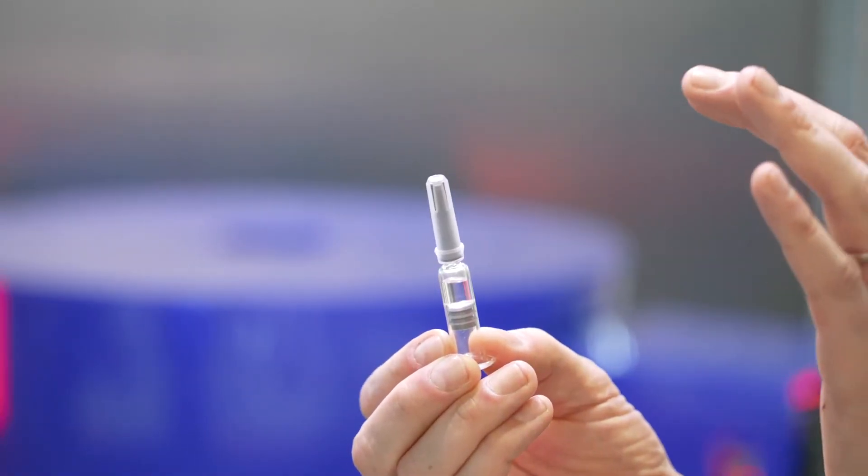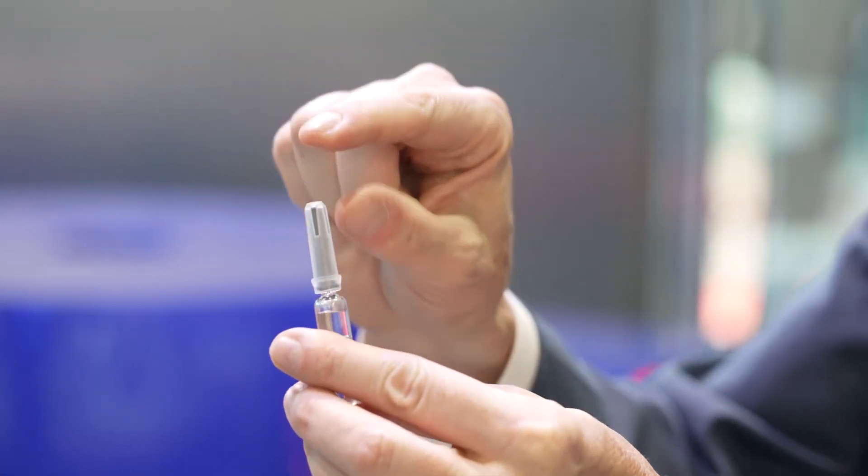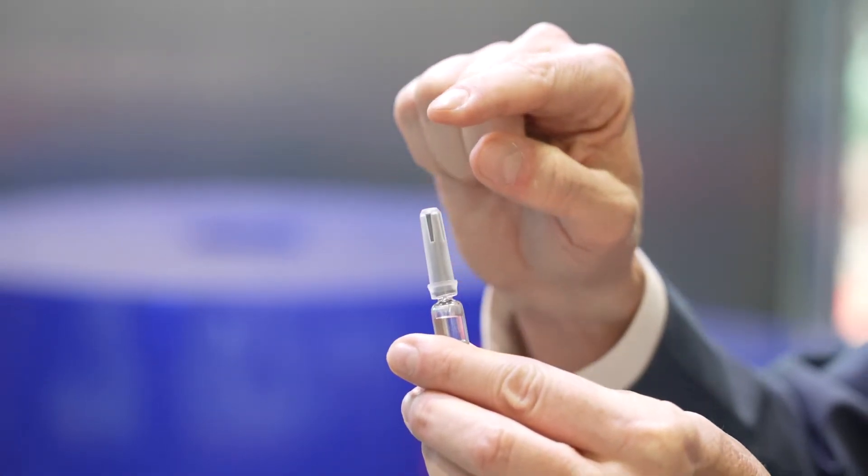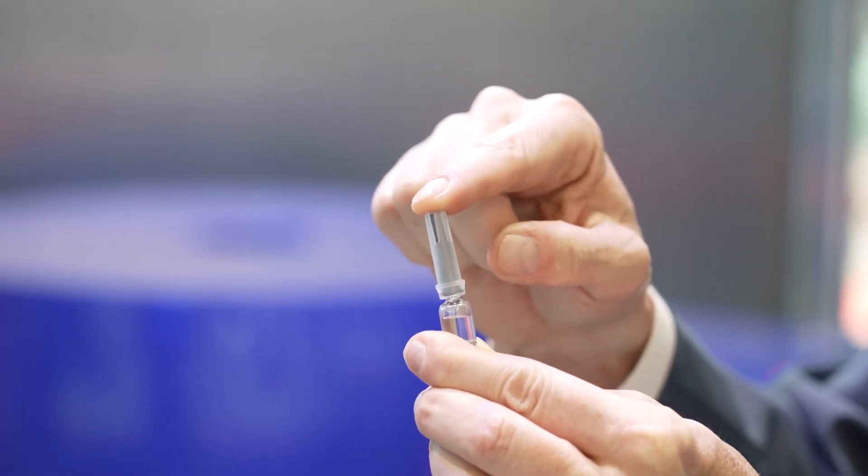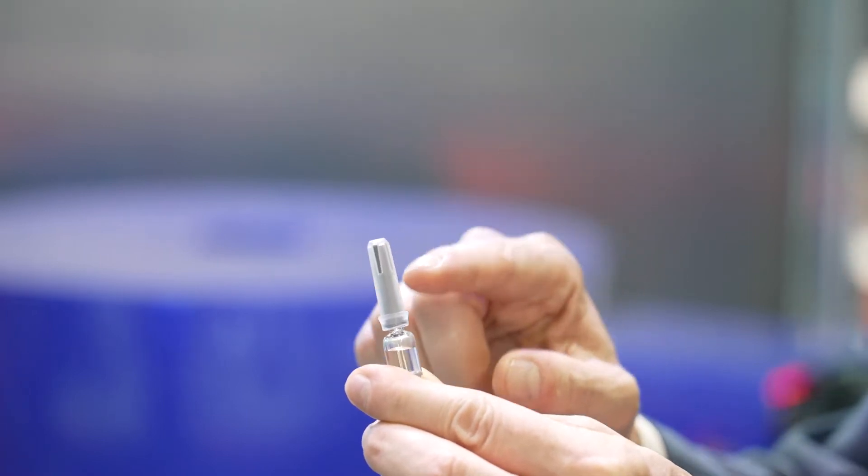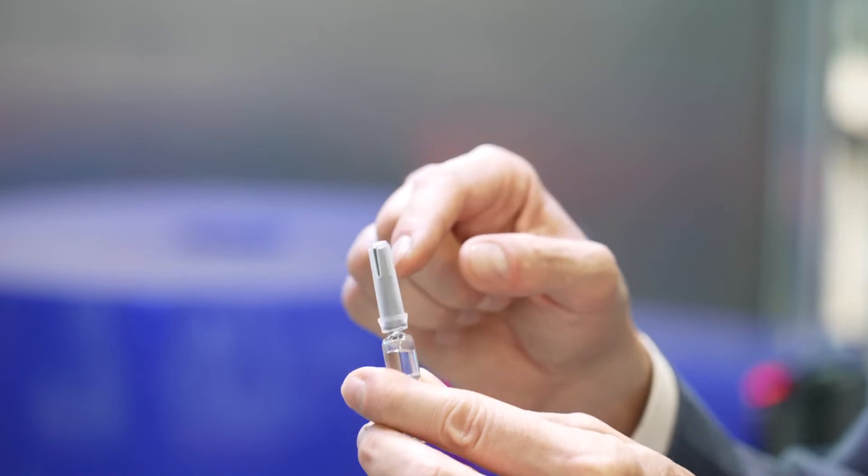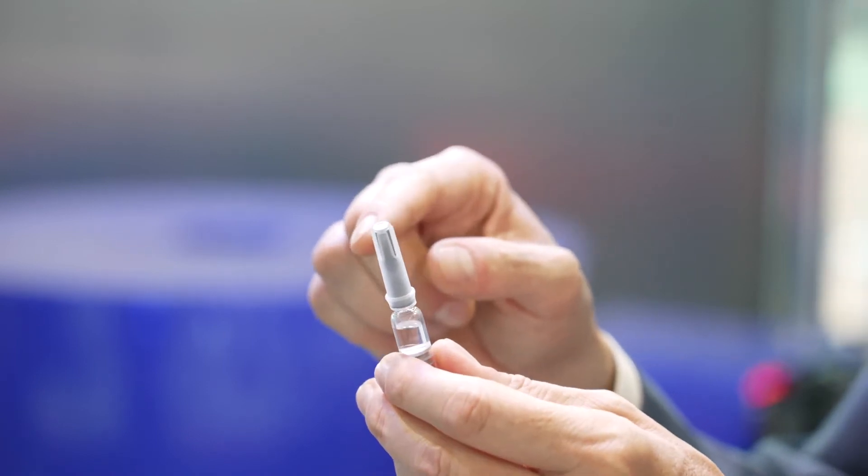Then we have the needle shield inspection. We check the needle shield needs to be present, not bent, not broken, not too high or too low. And of course, we don't want to have the needle sticking out. This can also be dangerous for the final recipient.